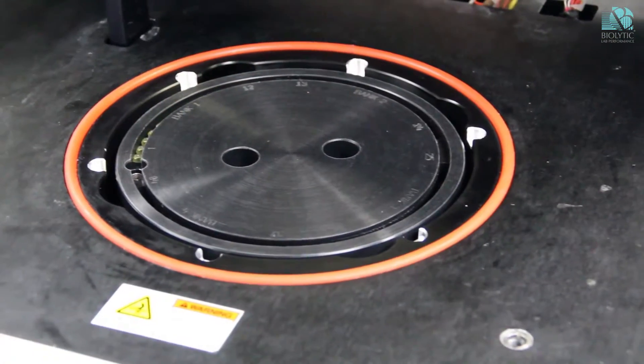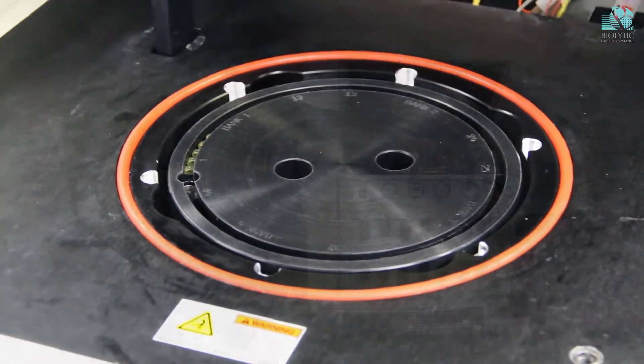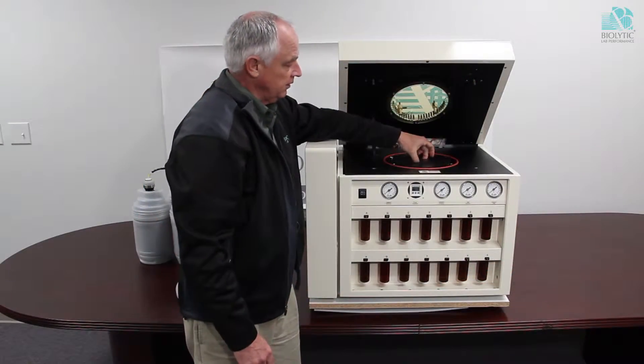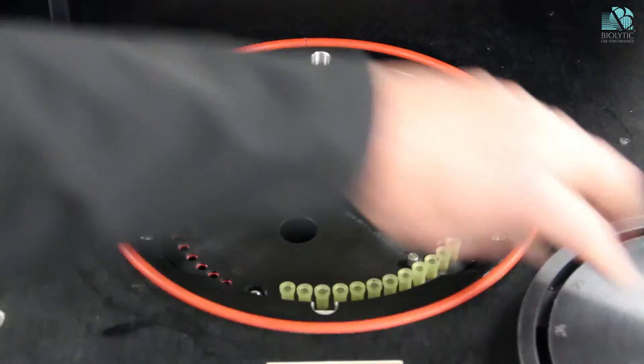The chamber, you can see there is a spacer now that sits on top of the synthesis rotor. This lifts out for access to the columns.